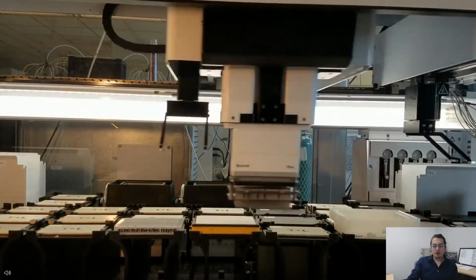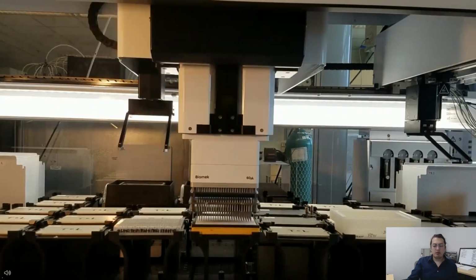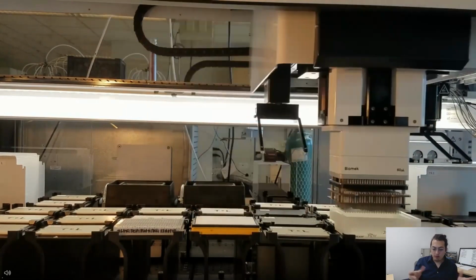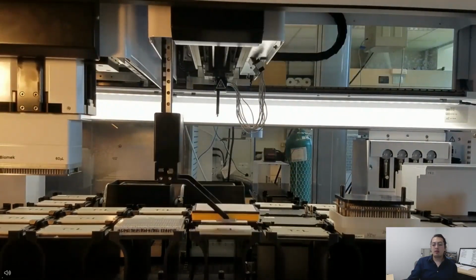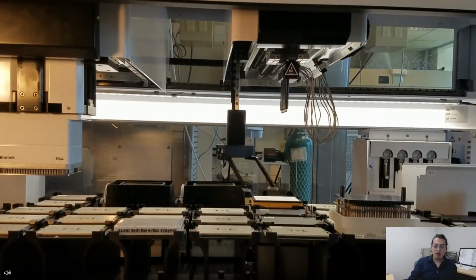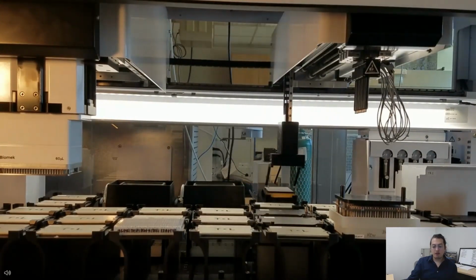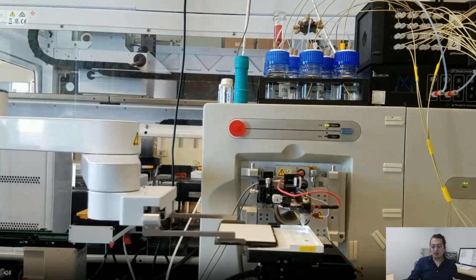So here first we're seeing the deck of the fluid handling workstation. We're taking the pin tool dips on a well plate, and then it transfers to the DESI plate, which is that white thing, a glass slide coated with a PTFE membrane. Then you take the DESI plate, which is just supported on a 3D printed holder that makes it easier for the robot to grab. You will put it in a shuttle, and then it will send it to the back of the robot, where you will take the slide again and put it on the DESI stage for the analysis to start.